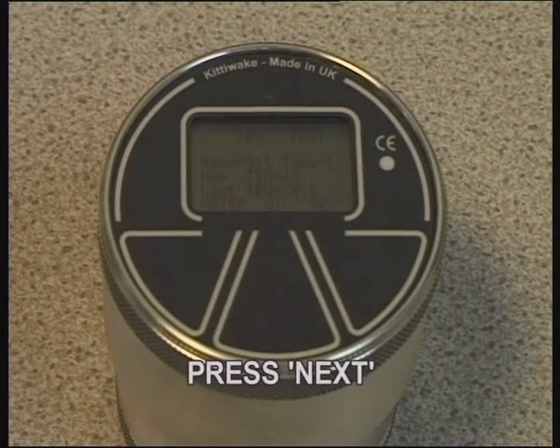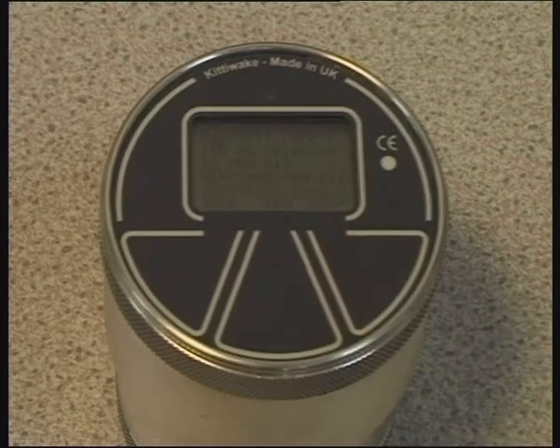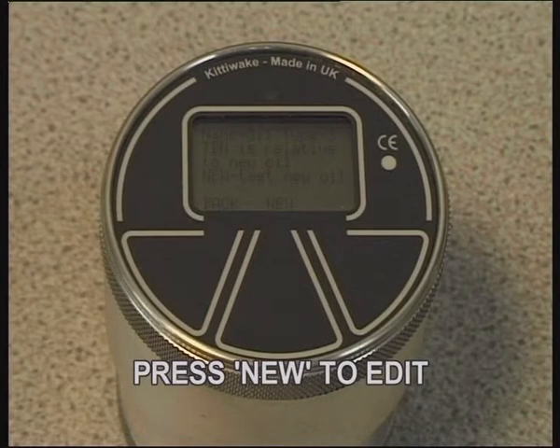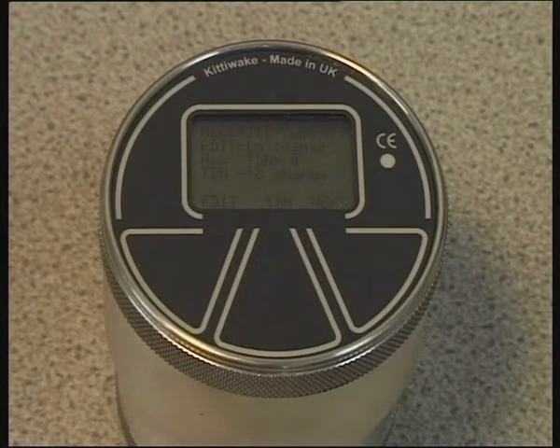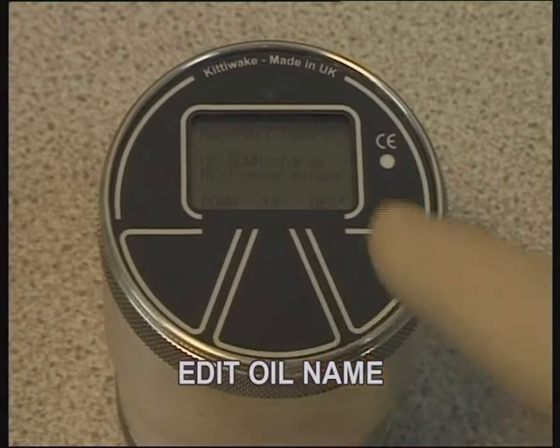Press Next to continue to edit or to create a new oil. Press New to edit the new oil. Press Edit, then up or down to edit the new oil's name. Press Next to move to the following character.